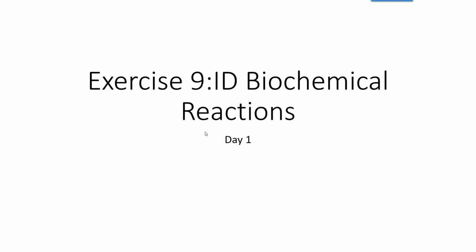So I'm going to make it one big video going over all the different ways we set up our gram-negative biochem reaction tubes. I'm also going to go over a couple of tubes that are biochemical reaction tubes, but they are two tubes that we use for separating out or identifying gram-positive cocci that are catalase negative. So I recommend having both.